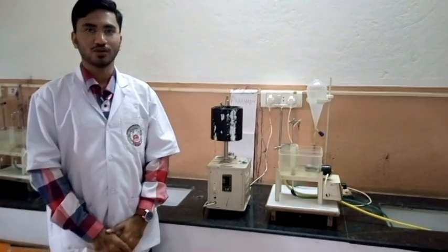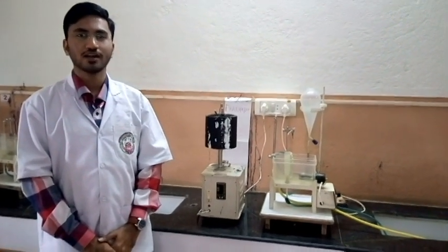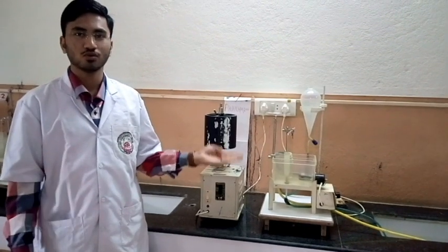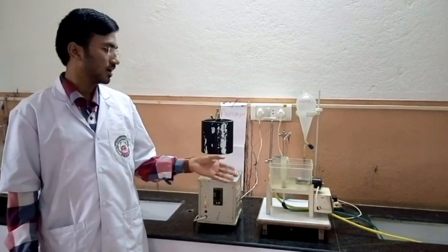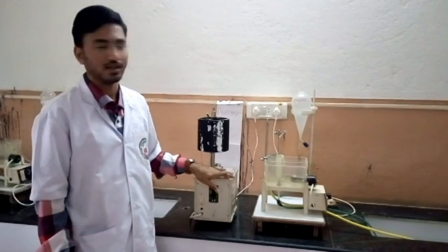Welcome to our YouTube channel PharmaCon. This is our very first video and I will be like to introduce you to the most widely used experimental instrument in pharmacology, the student organ bath.